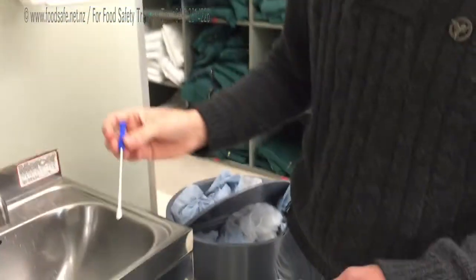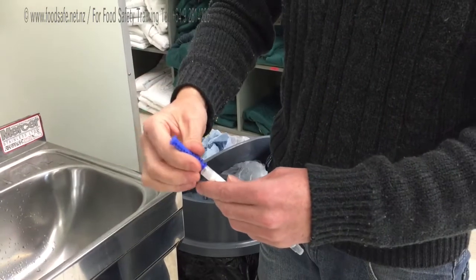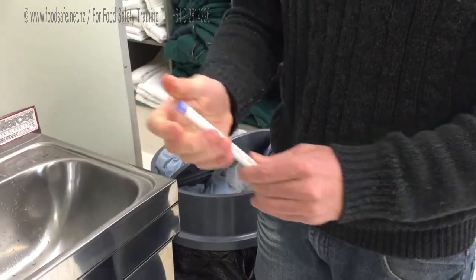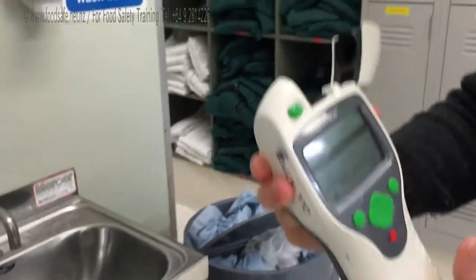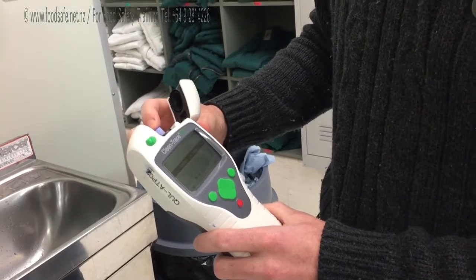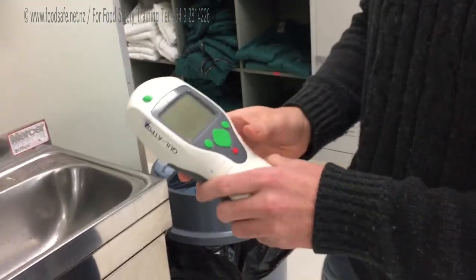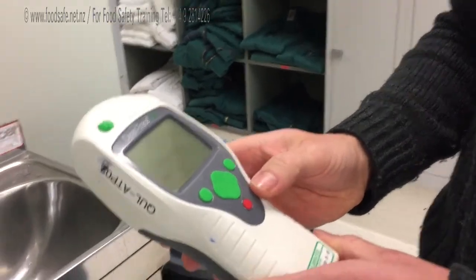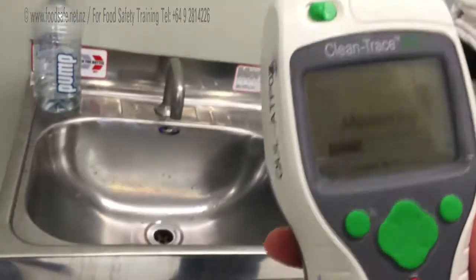Then, pretty simple, you just put it back in and push it down. Put it back in the device which will read your ATP reading. Just push it down, close, and select, and it will measure your ATP value.